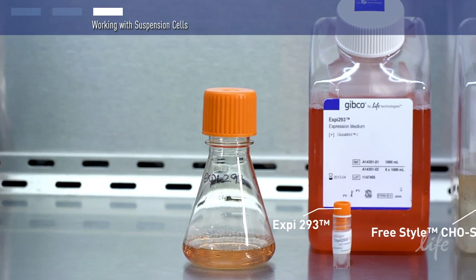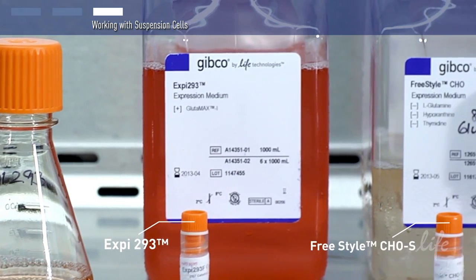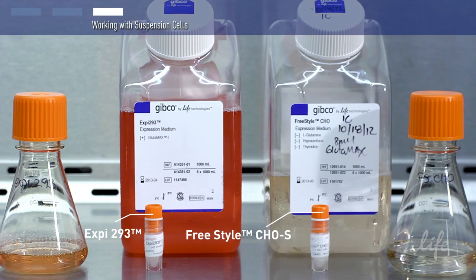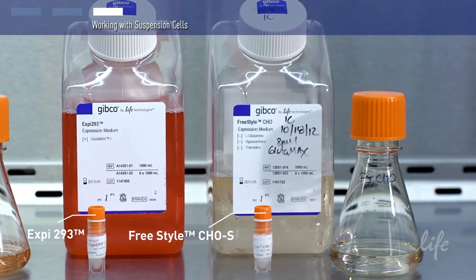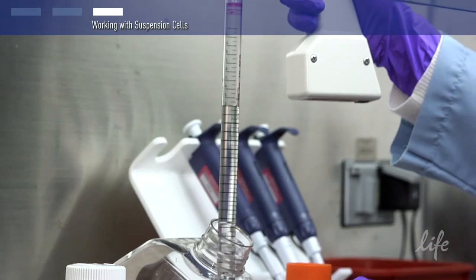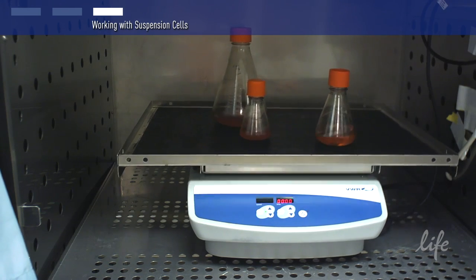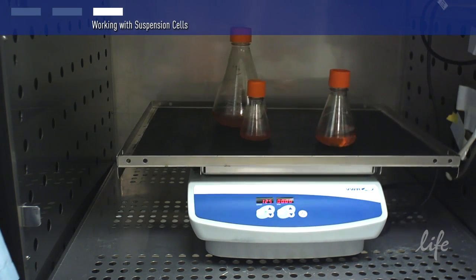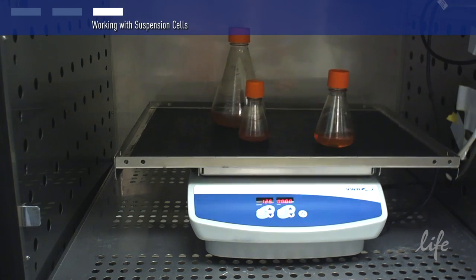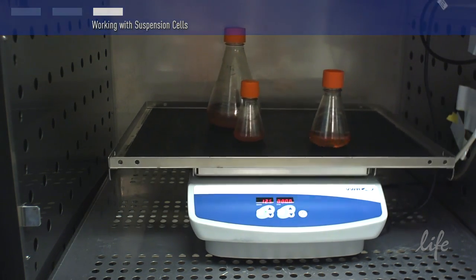Last but not least, you will need some cells to transfect. The most commonly used cell lines for protein expression work are 293 cells, like Freestyle 293F and XB293F cells, and CHO cells, like Freestyle CHO-S cells. Life Technologies offers a range of mammalian transient protein expression systems for functional proteins with appropriate post-translational modifications. Learn more at lifetechnologies.com.